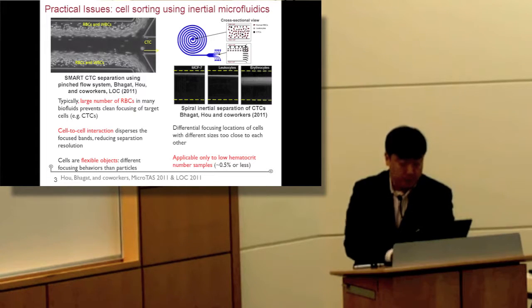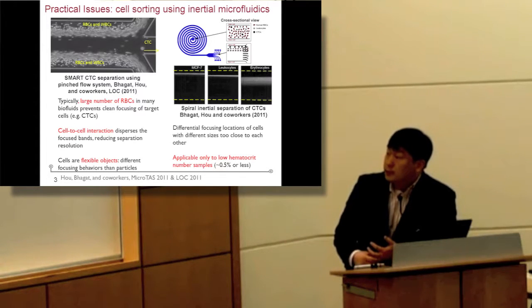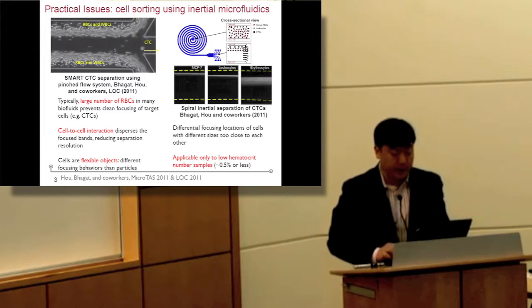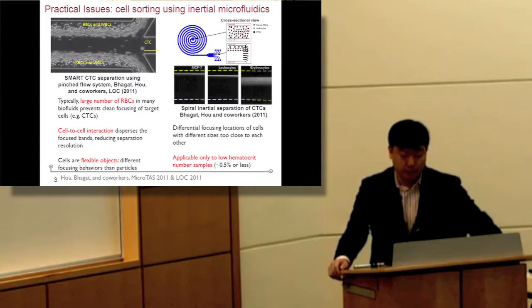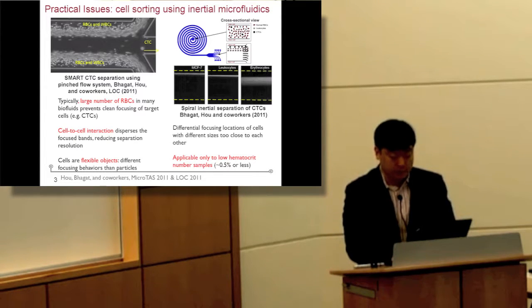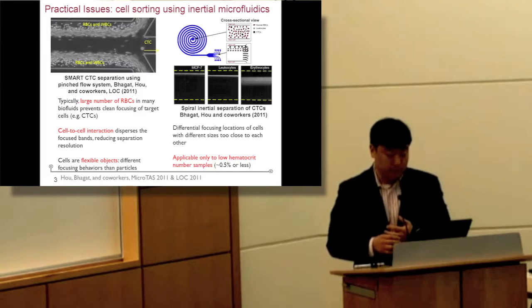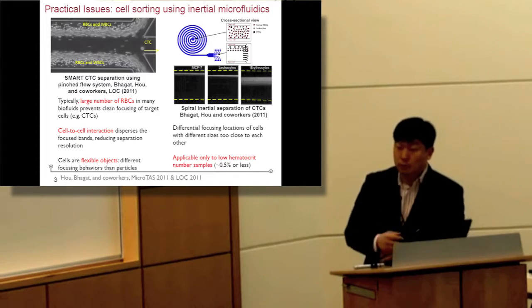First of all, blood, for example, is a very complicated object. You have a 40% volume basically filled up by red blood cells, so it's a very high background content. And whenever you try to separate these 40% hematocrit samples, you run into a problem. Even these inertial microfluidic systems don't really work for such high hematocrit samples. Because of that, you have to dilute the blood, and that limits the overall throughput.